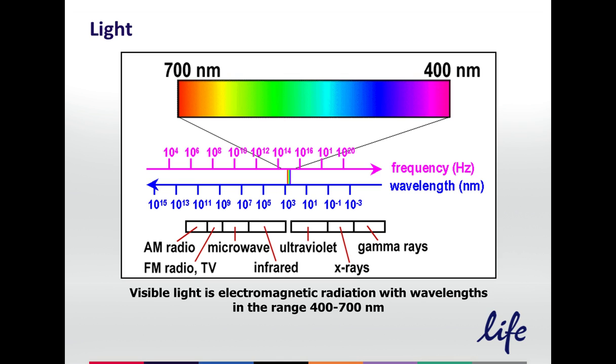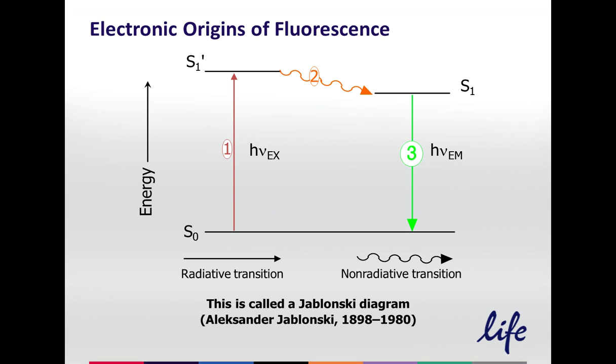And of course, in all of this discussion about fluorescence, we're talking about the visible wavelength mainly. That's what most assays utilize, anywhere from 400 nanometers up to 700 nanometers, and sometimes beyond that into the infrared. Those are the wavelengths that we're interested in for biological imaging. So when George Stokes looked at his quinine sulfate, he began to understand, for instance, that when you excite, a longer wavelength comes out the end.